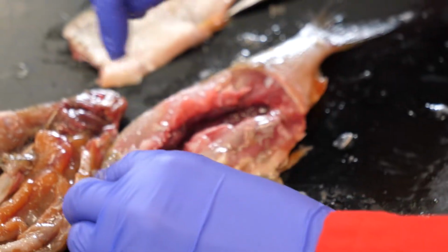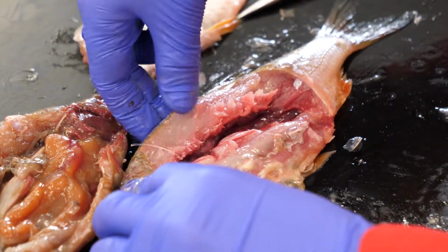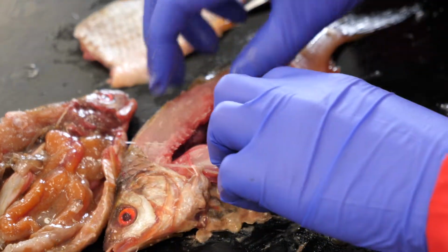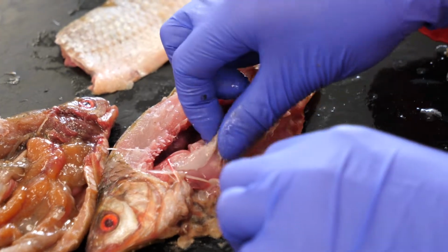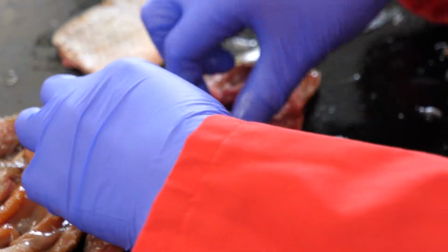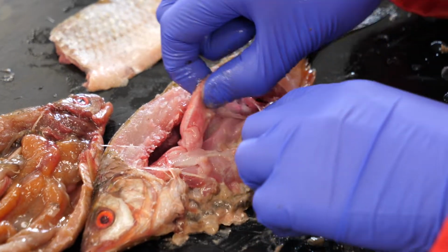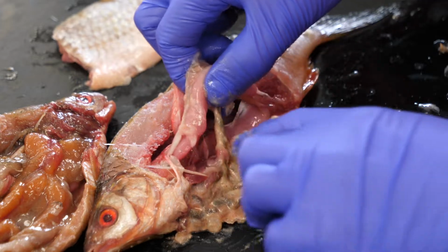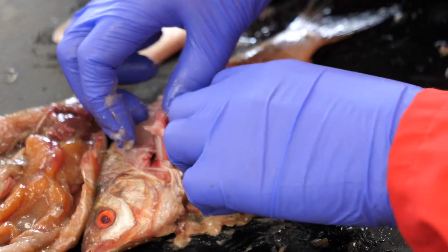Now here, we've got the backbone and quite a large amount of tissue between the backbone and the top of the fish. So we've got several structures in here I'm just going to pull apart. Because both of these fish are a little bit defrosted, it can be quite difficult to tell some of the structures apart.